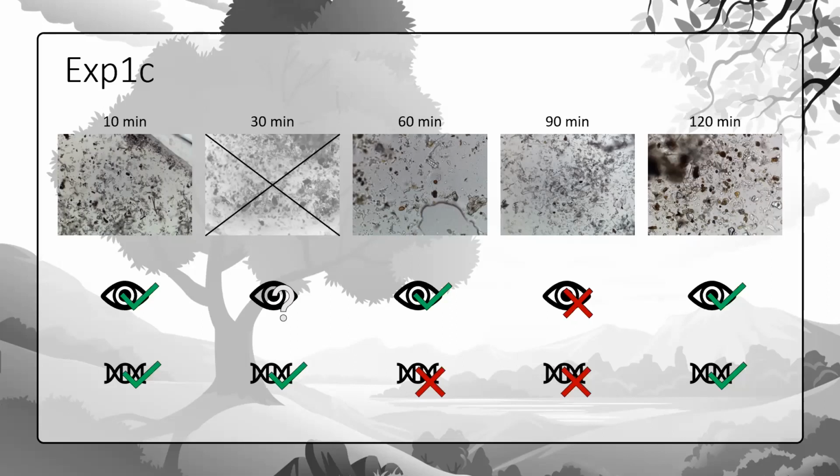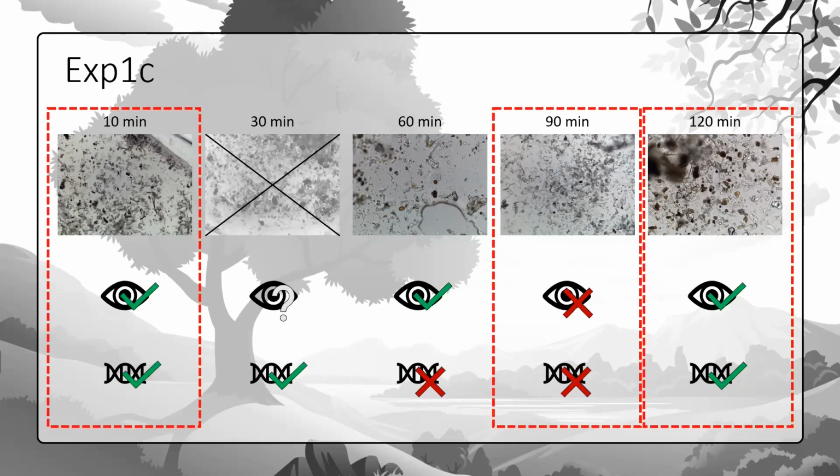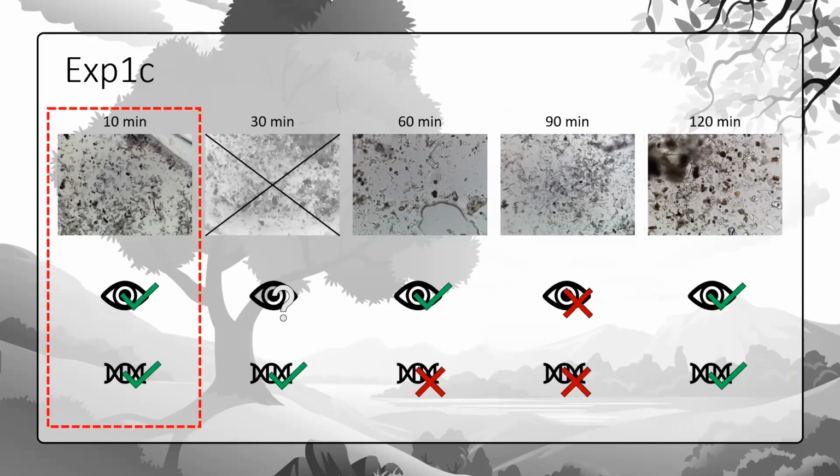And you see already the results. Interestingly, where there was nothing to see, there is nothing. Then the 60 minutes, I don't know what happened there. Bad crushing of spores, maybe. And interestingly, even in our 10 minutes, in our short sampling time, we found something. So we go a little bit further into these three, starting with the 10 minutes.